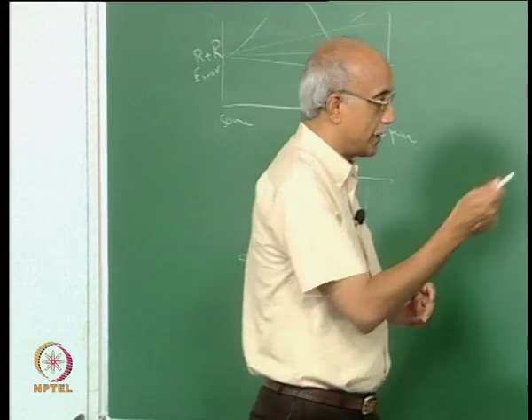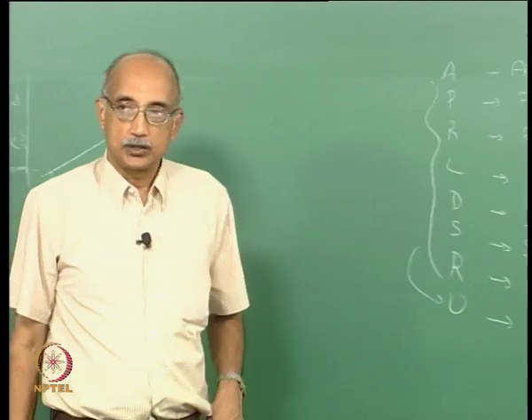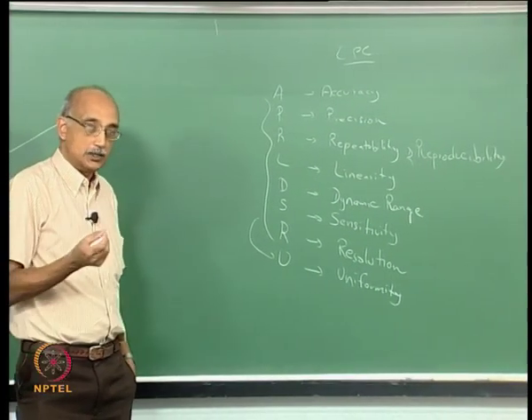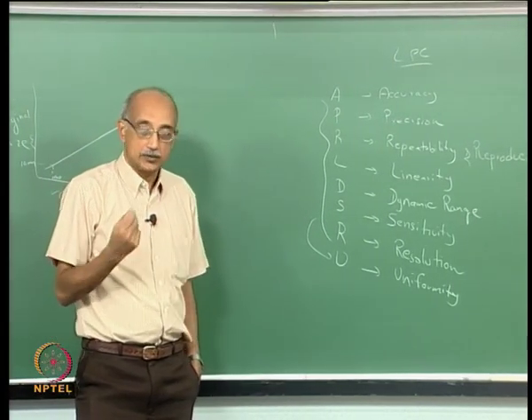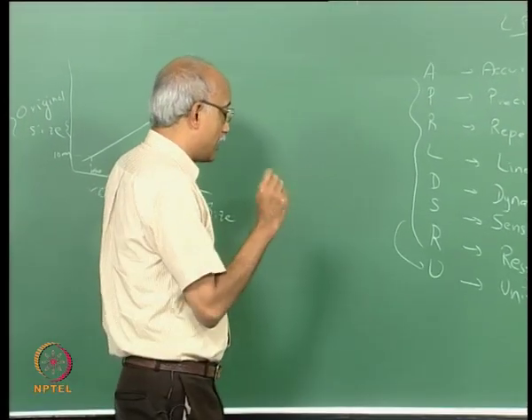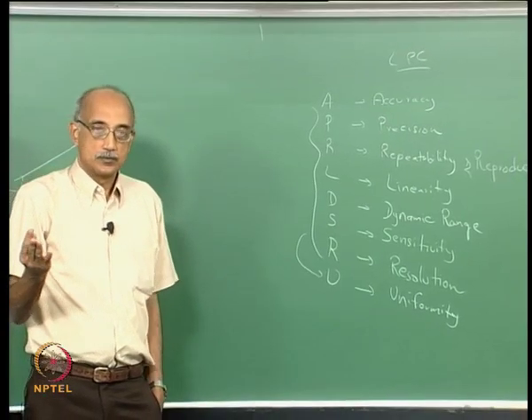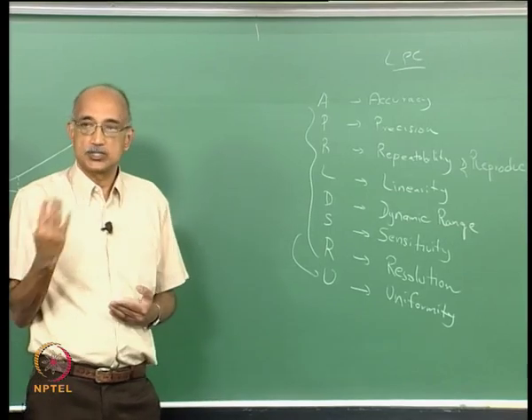Okay, so going back, given that all these characteristics have to be satisfied in a particle counter, it is clear that the readings that you obtain from a particle counter, the quality of the data, very much depends on how well controlled and how well characterized and how well calibrated the operation of the instrument is. Now calibration again is a very important step because it makes the bridge between data that you obtain from your instrument to something that is traceable as an absolute standard.